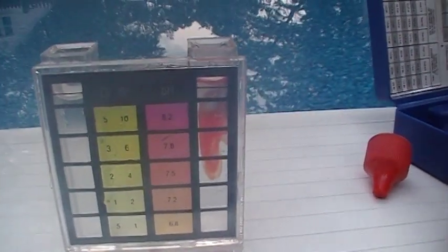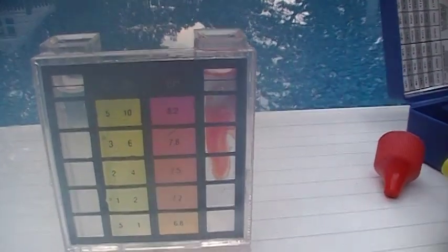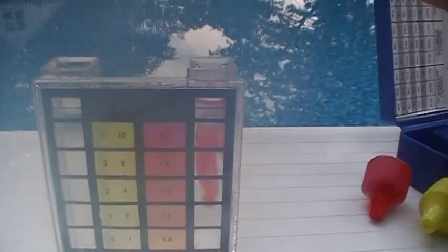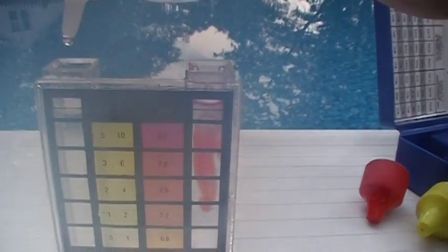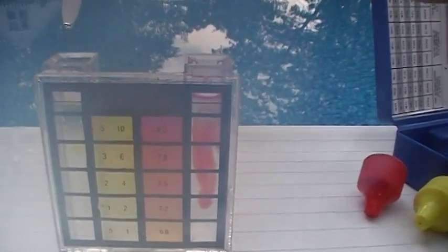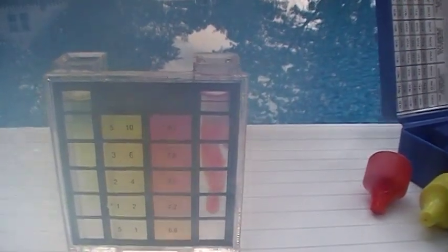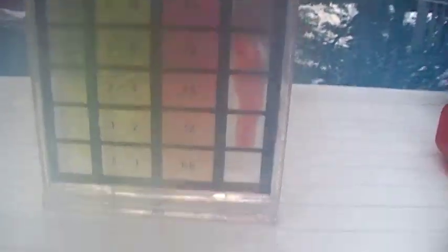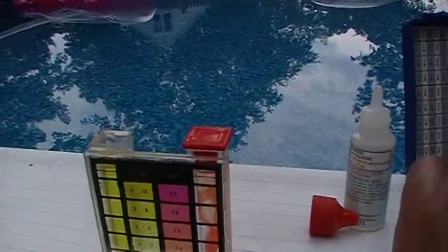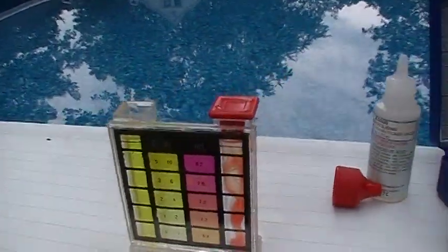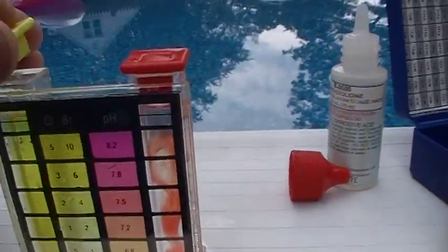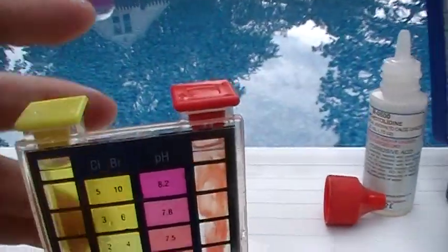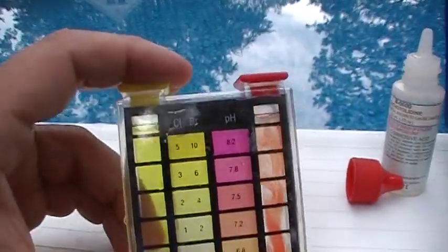Then you'll add the yellow one for the chlorine. You can see that it starts to turn yellow and red. Then you put the little caps on and shake it.